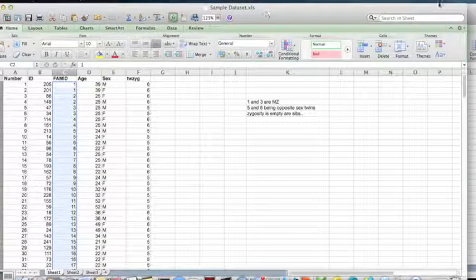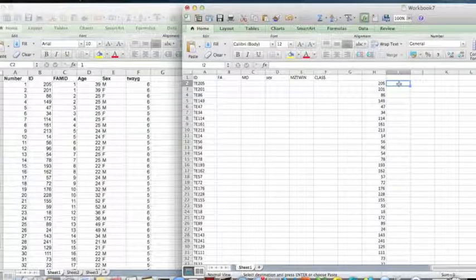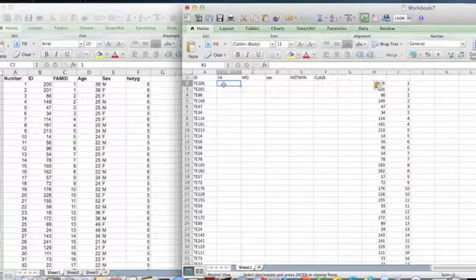So now that that's done, I'm going to paste this in the far right column because I do want to code them slightly different. So how you code this is by basically, we need the letters FAID in front of the numbers here, but I'm going to use TE-FAID.